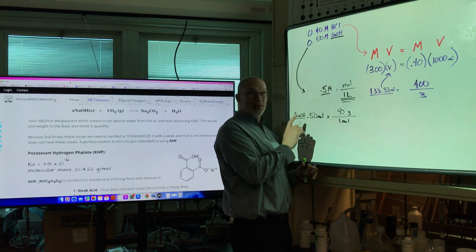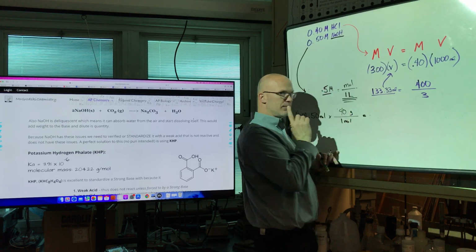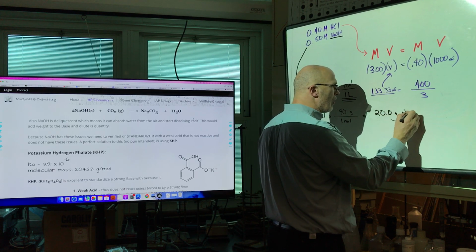In any case, we can do this math. 0.5 times 40. 20. Okay, so 20.0 grams of NaOH.